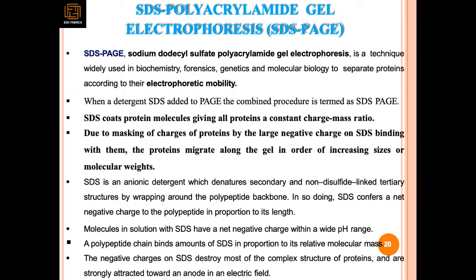SDS coats protein molecules, giving all proteins a constant charge-to-mass ratio. Due to the masking of the proteins' charges by the large negative charge of the SDS binding to them, the proteins migrate along the gel in order of increasing size or molecular weight.